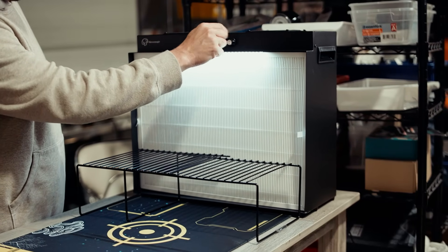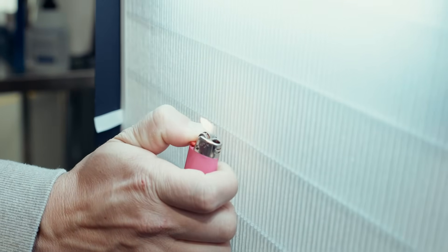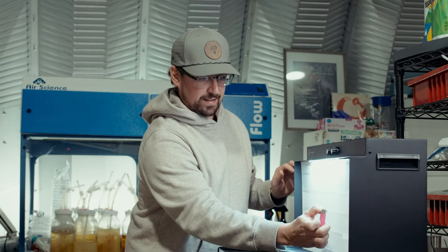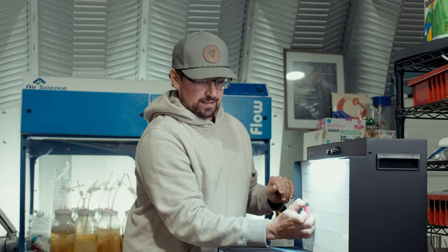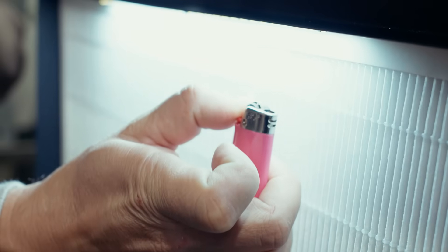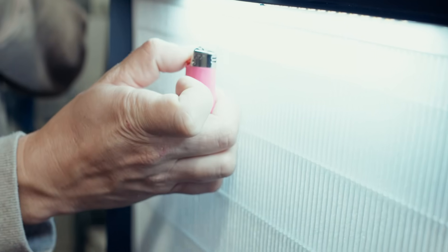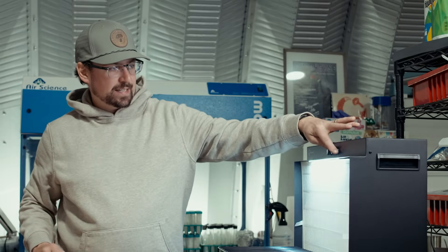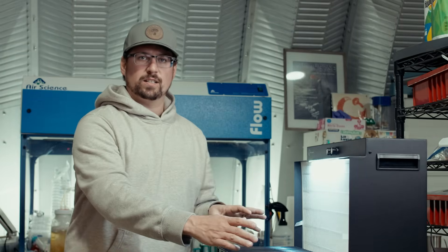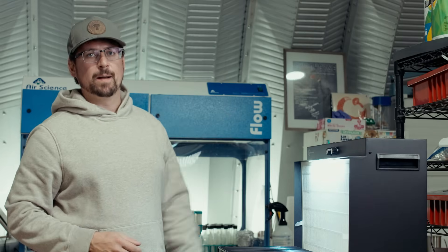The lighting shifts with the fan speed to give you a visual indication. I'll do the proverbial lighter test — you want it flickering but not blowing out. It's at about a 30 to 45 degree angle, really good fan speed. On full max you can see it blowing with no dead spots in the flow. Up at the top it actually blew the lighter out, which is great for the workspace. Next I'm going to open up some petri dishes for about a minute to let them collect air, then close them up, put them in the incubator, and see how it does.